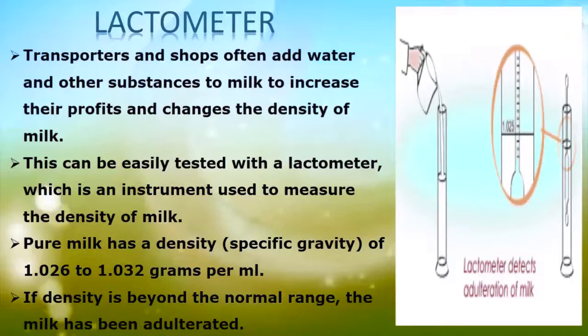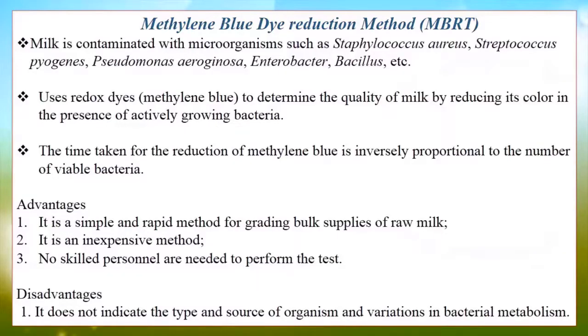Okay, so the next slide is slide number 6. It's a very important topic in the quality determination of milk. The technique is the MBRT technique, the methylene blue dye reduction technique. The milk is contaminated with microorganisms such as Staphylococcus aureus, Streptococcus pyogenes, Pseudomonas aeruginosa and Enterobacter, etc.